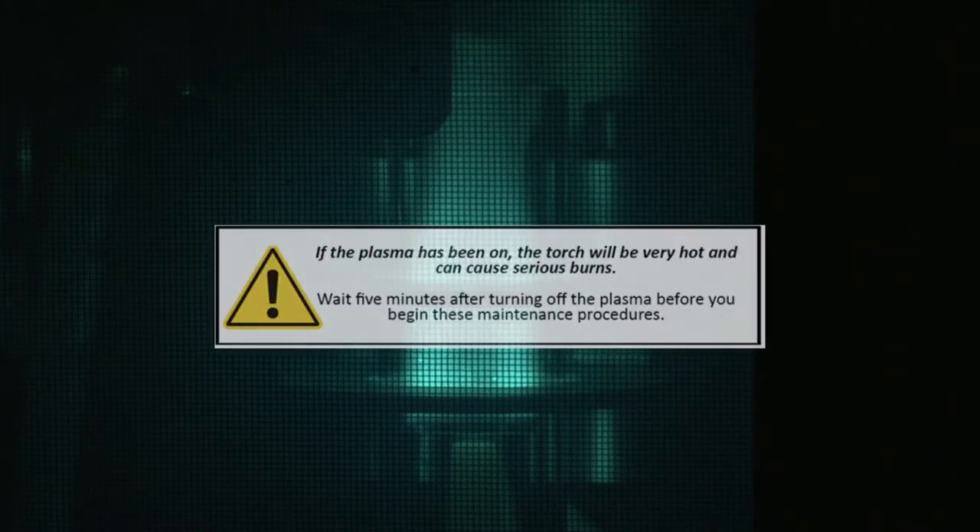Before accessing the torch, please ensure to extinguish the plasma and wait for the torch to cool for a few minutes.